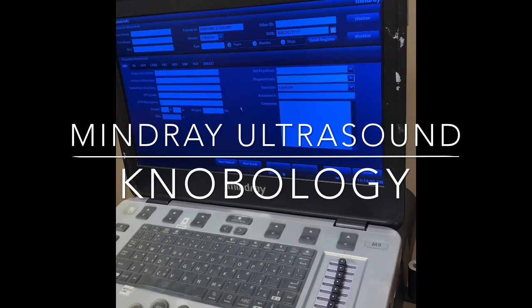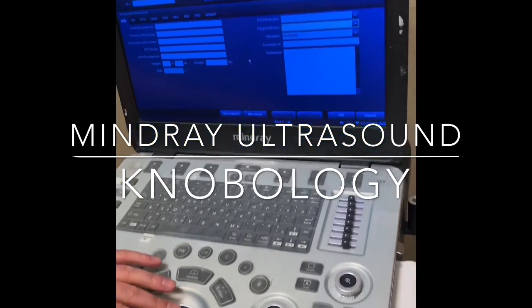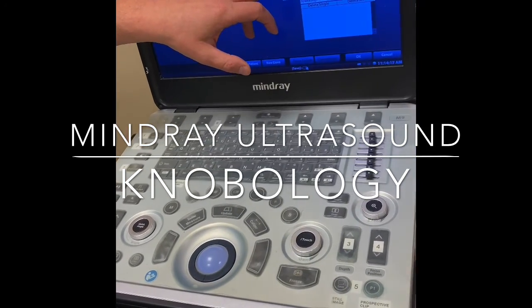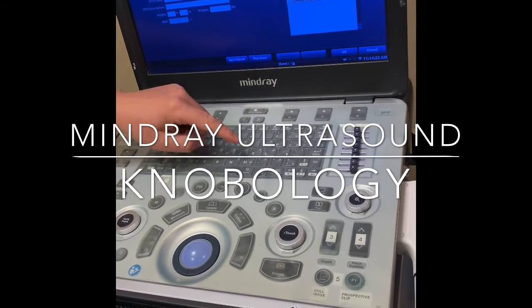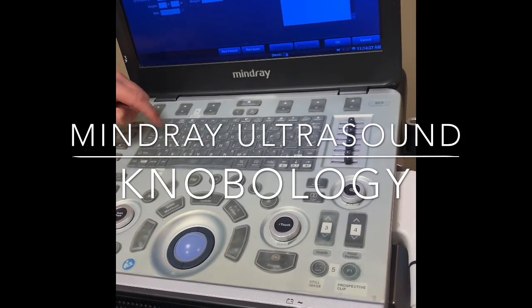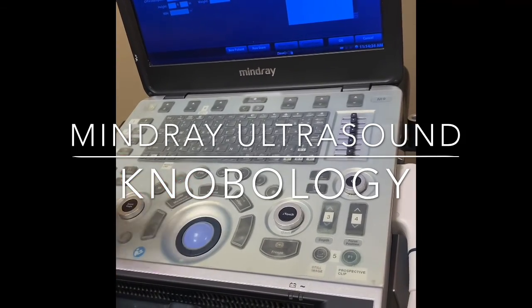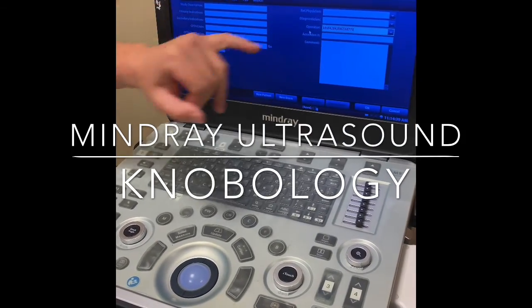You also have the option of manually inputting this information. To do that, you click on the field, and let's say there's a second attending who wants to add their name on. They have to put their name in the operator field, not the diagnostician field. What you would do is separate each user ID by a comma and no space and type in the name. When you scan the barcodes, please look to make sure that the correct information populated.